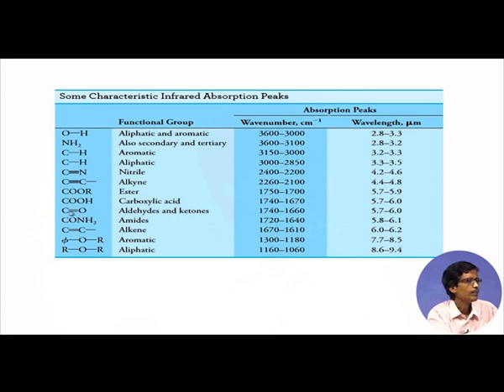So, we can have this group for carboxylic acid as well as amide, but there is a change. Now it is not the group attached making it a carbonyl or aldehyde, but you can consider a change where you have the C=O function with the attachment of the OH.